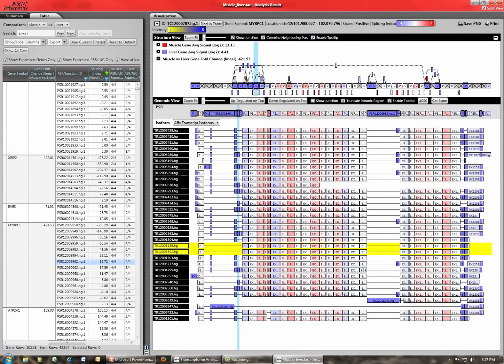So we could look possibly at this guy and that guy as we move from left to right. They don't have any significant blue all the way across until we get to here, right? So when you get to this final set of exons here, you end up finding again some that are significantly overexpressed in liver, but they also contain this exon that's present in muscle. Based on this, we have again two possible explanations. One, that there are transcripts that exist in nature that haven't been put into the databases yet, which is quite possible. And the second is it's just a relative expression, right?